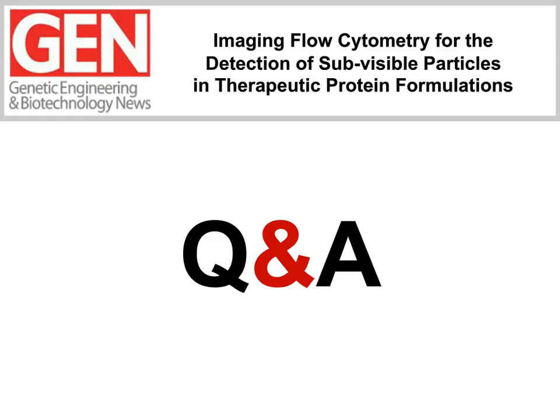Okay, great. So we're going to give you another question real fast there, since that was a pretty easy one, I think, for you. Why is it more analytically challenging to measure protein-based subvisible particles? Well, the challenge there is that historically analytical instrumentation has been calibrated using polystyrene beads or hard spherical beads.